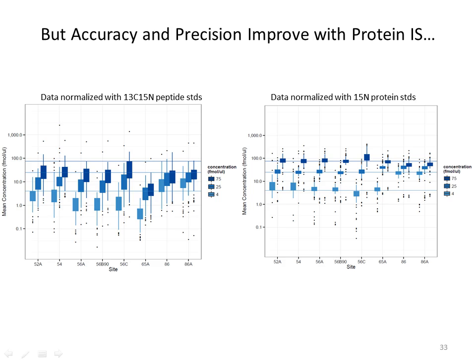So here's data from the blinded samples where, again, these are the different sites that analyzed the sample kits, and then the reported or calculated concentration based on the peak area ratio, where on the left we use the C13 N15 peptide to normalize, and on the right we use the N15 proteins. And what you see is that the theoretical accurate, proper concentration is shown with these horizontal lines going across, and they're color-coded where the darkest is 75 and the lightest is 4 femtomole per microliter. So that's how much was spiked into the sample in light protein.